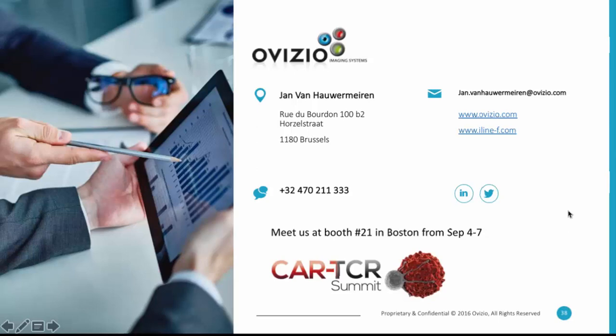Matthew asks, are there any plans to include sample retrieval for offline analysis? For example, it would be very useful to be able to characterize specific cells after they have been imaged for several hours or days. So all the information on the cells is already available. So all the information is kept and all the information can be exported.